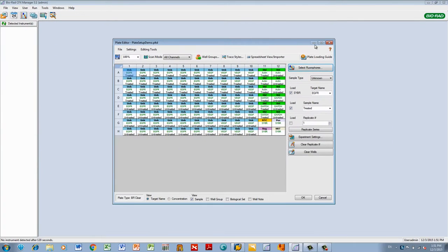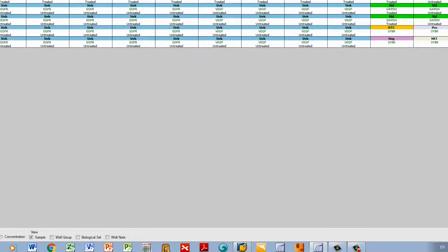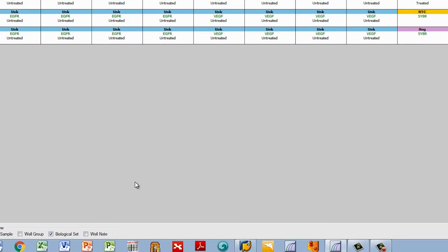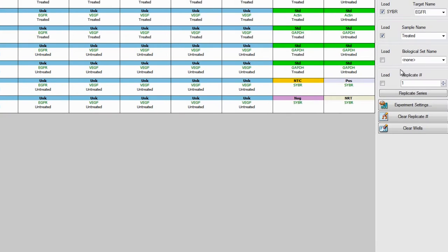We will first set up the biological replicates. To do this, check the Biological Set box. Biological Set Name appears in the menu on the right.